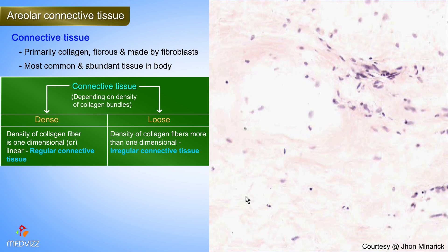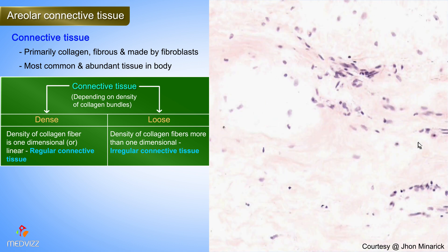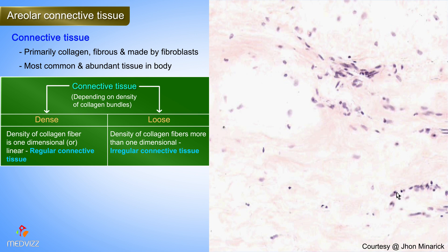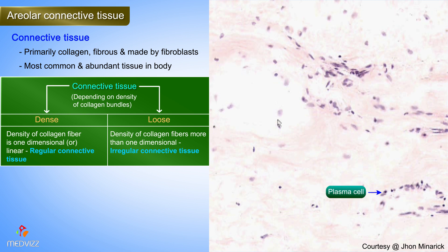Loose connective tissue is more likely to have other types of cells, however. If the cell is round, the most likely cell it would be is a lymphocyte, especially if it has minimal to almost zero cytoplasm. If the nucleus is eccentric, that's more likely to be a plasma cell, although there are other classical features of plasma cells.